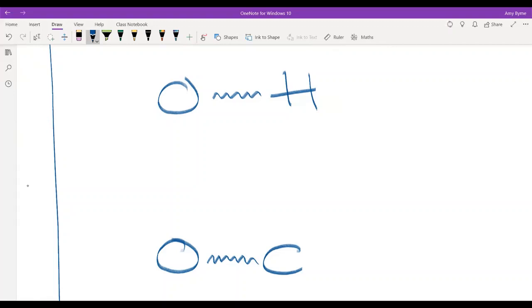Now, the exact frequency that this vibrates at is dependent on the atoms on either side of that bond. So, if I run through the IR spectrum with a molecule, I will see absorbances at particular wavelengths that correspond with the bonds in that molecule.